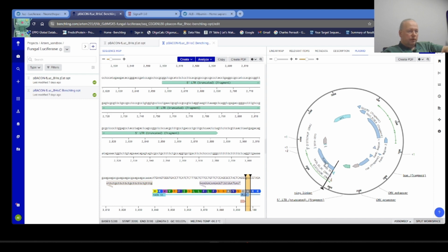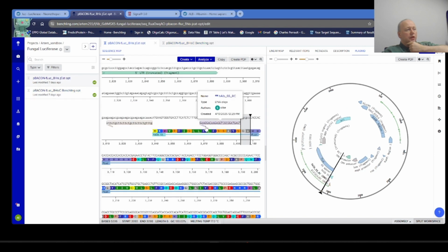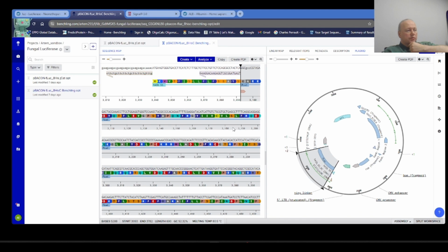Now the reason for there being 2 distinct gene sequences is that behind the scenes I've done 2 codon optimization and reconciliation strategies. One from JCAT and one from Benchling itself. They produce rather distinct types of optimization, and it would be curious, since we're doing this for fun, to see which one is a winner.